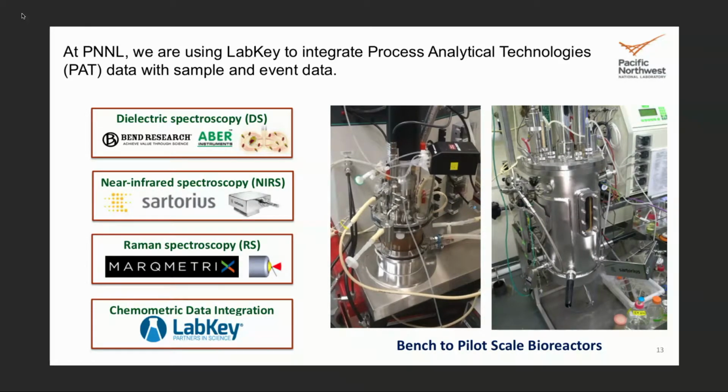And they've come out with a Raman analyzer that's a low-cost, high-resolution analyzer, and also a probe with a sapphire spherical lens that has very high optical resolution, but also makes the probe very adaptable. You can stick it in a liquid or a powder or a slurry, and it's instantly in focus. So they're going great and selling these things like hotcakes. So we're looking at applying that to the bioreactor.